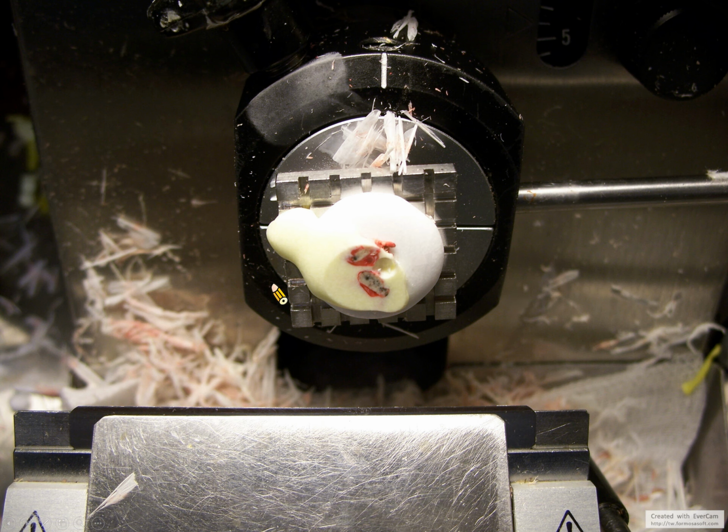So the pathologist just puts this tissue in this freezing machine. It is frozen by liquid nitrogen, and you can see that the tissue will be frozen, and you can use a very sharp knife to cut it into very small, very thin pieces of tissue.